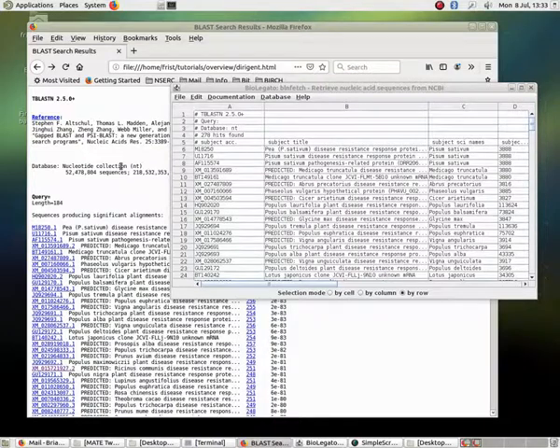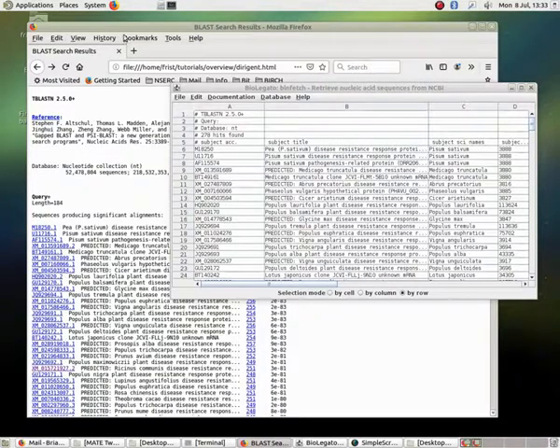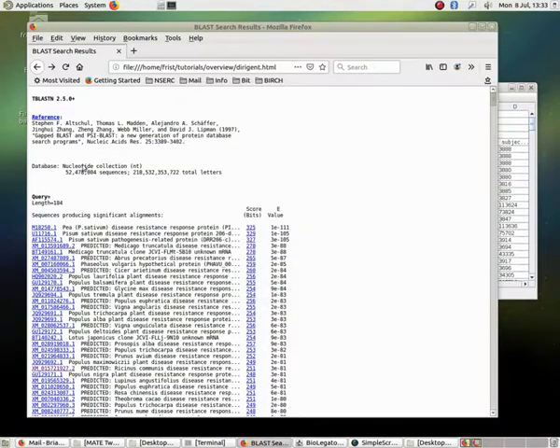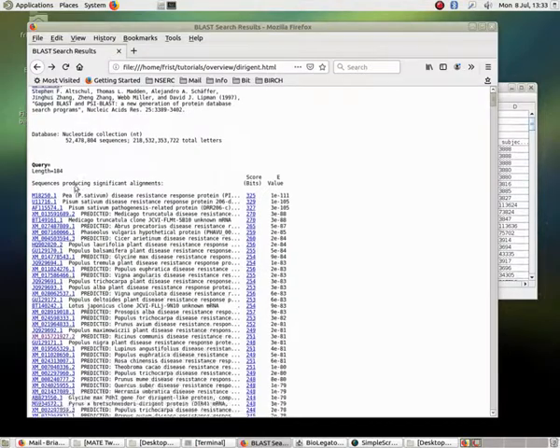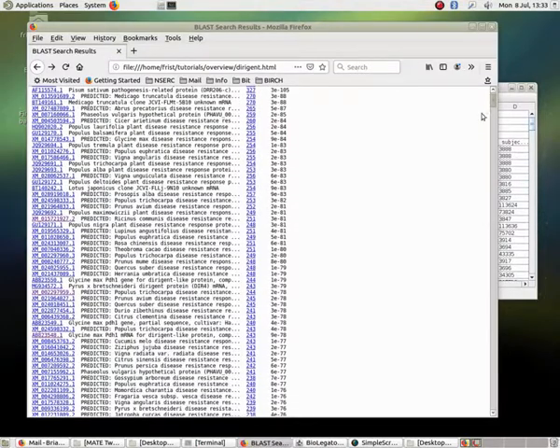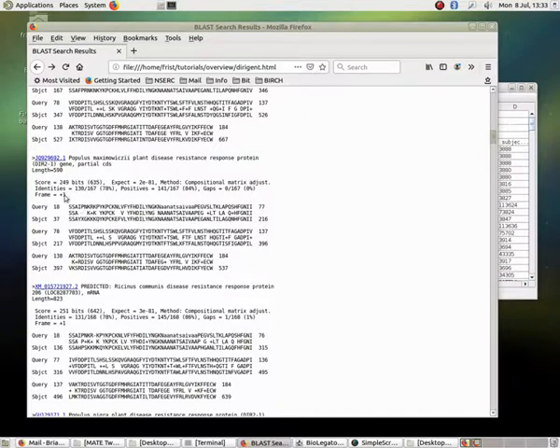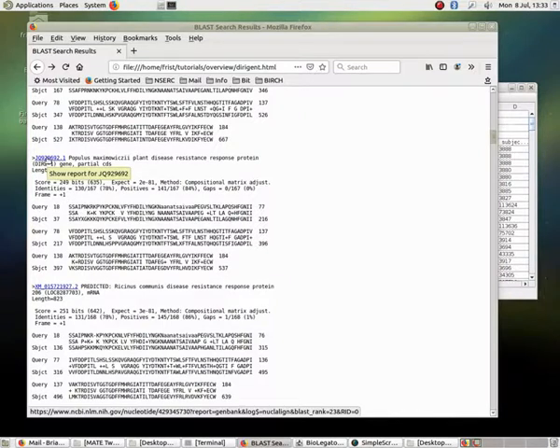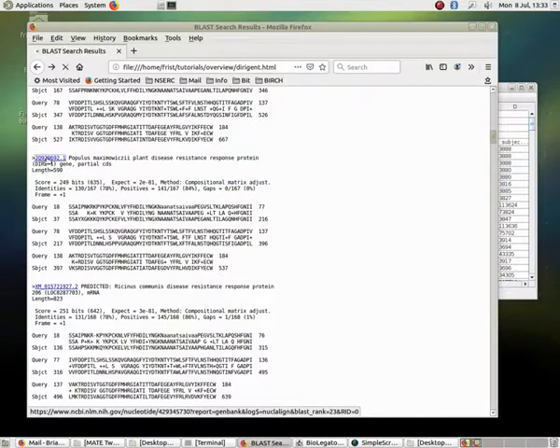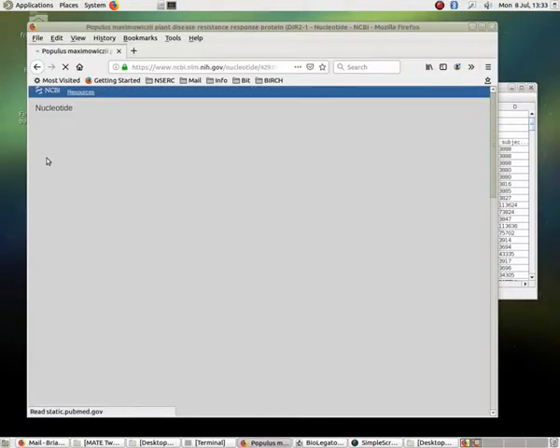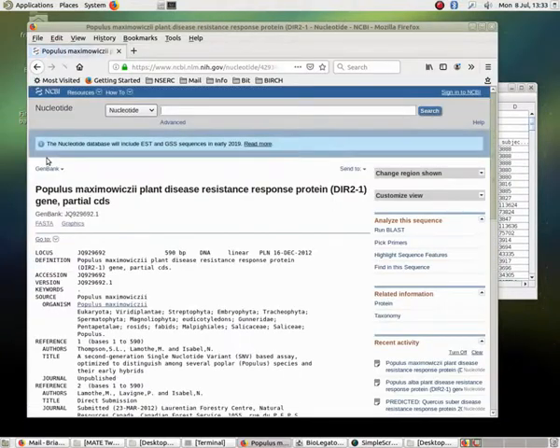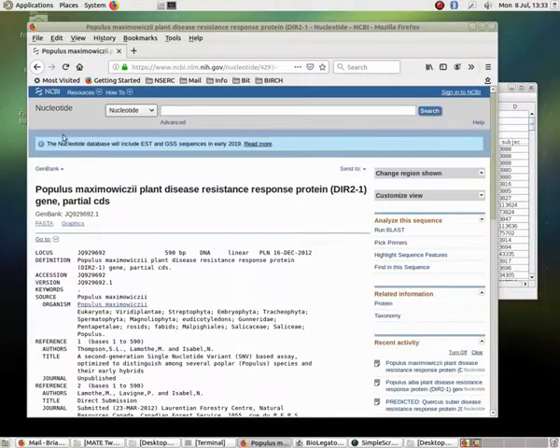We've got our BLAST output in two different forms. One is the familiar web page output showing all of the hits, both as a list and also the alignments of the hits. One of the nice features is you can click on any of the hits and have a look at the sequence at NCBI.